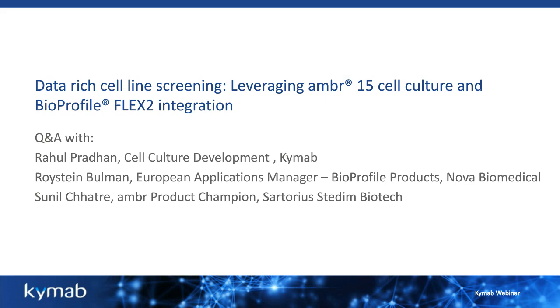It's also worth bearing in mind that when we teach people how to use the ambr15, we always supply them with a little Excel spreadsheet, which allows you to enter the volumes of feeds, the volumes of samples, expected base volume, and so on and so forth. And we always train people to design their ambr15 scripts in such a way that they ensure the working volume remains between the 10 to 15 milliliter normal operating range.